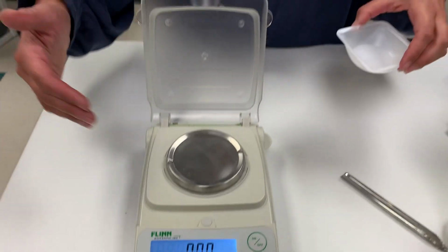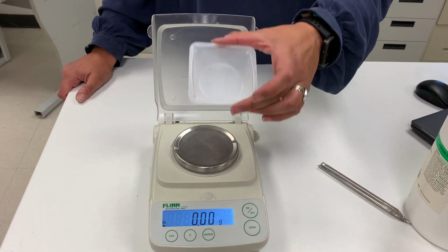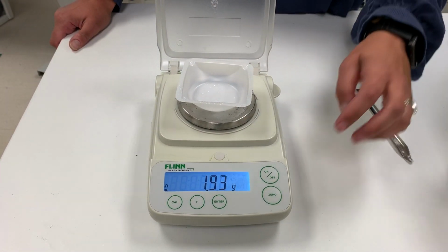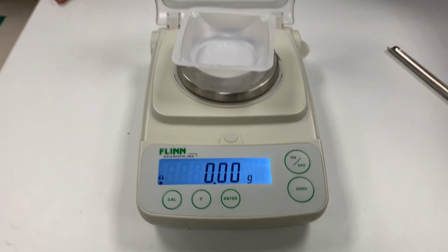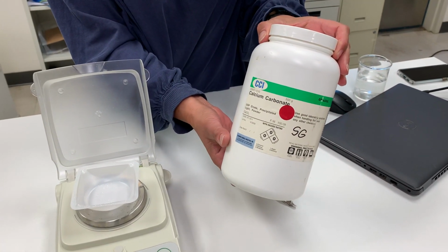What we're going to use instead of putting on the metal balance is we're going to actually use another piece of equipment known as a weighing container or a weighing tray. They're disposable. That weighing tray you are going to want to tare or zero so you take its weight out of your reagent measurement. Reagents are chemicals, dry chemicals that usually come in containers.